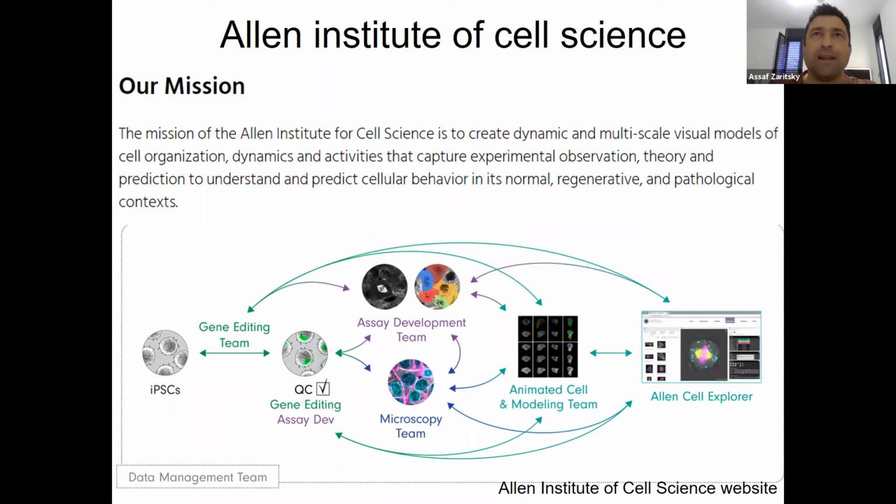So we are playing with the Allen Institute data sets a lot, and with some other data sets in the lab. And it's pure gold. You can extract so much information from this data, which is cool. So what you see here is what they do and all the contributions that they make. They have visualizations. You can look at the Allen Cell Explorer. You can look at how cells look and how they are composed.